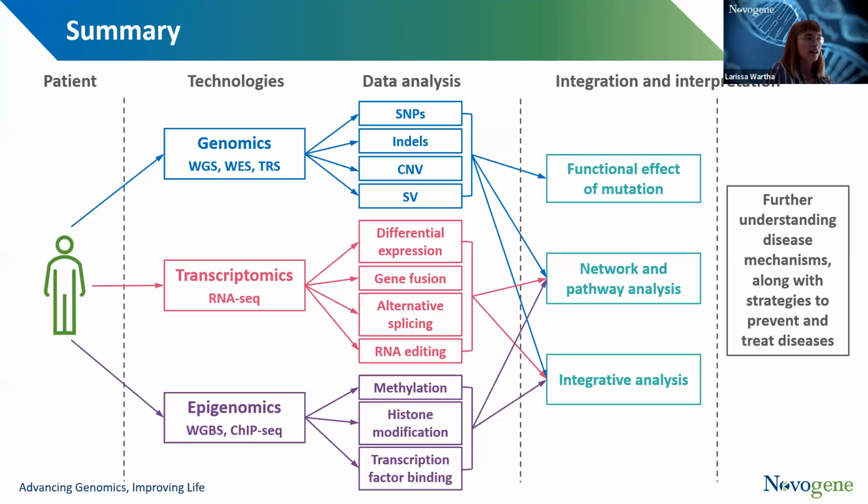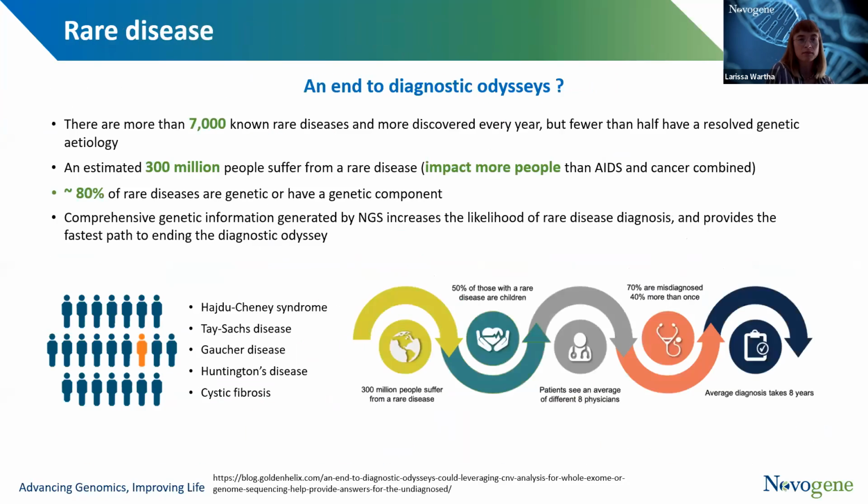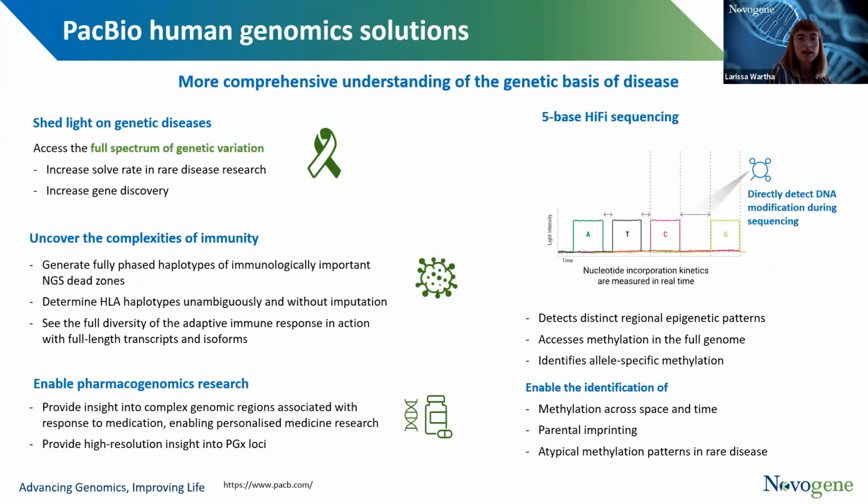Yeah, thank you very much for the question. And in fact, I will go back to the slide where we talked about PacBio human solutions. As you can see, the advantage of PacBio is the long reads. So you can sequence and cover multiple regions which are inaccessible, for example repetitive regions which are quite hard to identify through short reads, just because you cannot sequence them very well and you don't really get overlapping regions while assembling them, which you do when you do long read sequencing, because you get more overlaps.